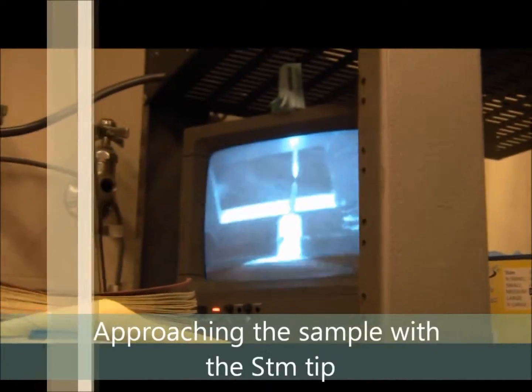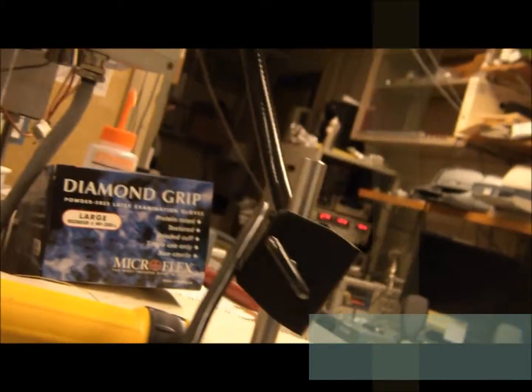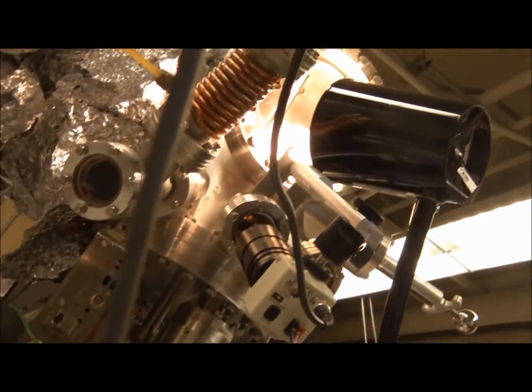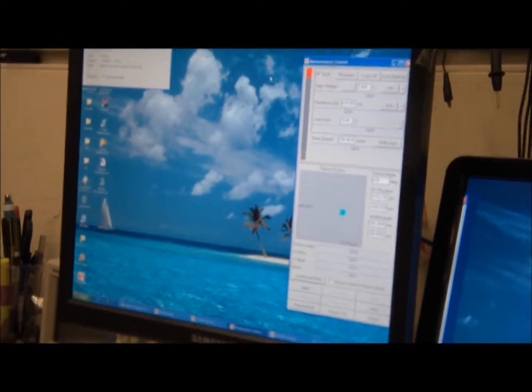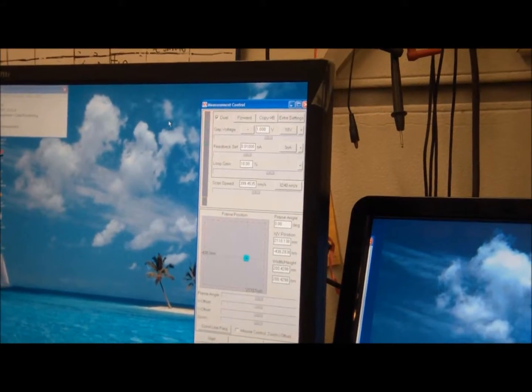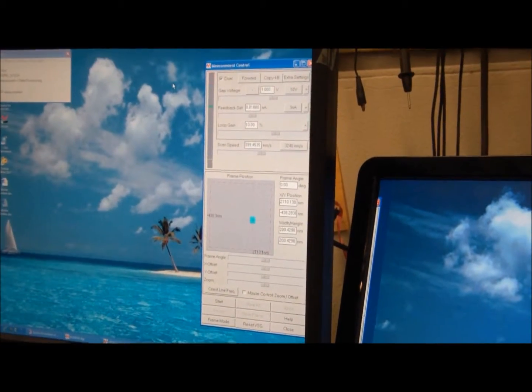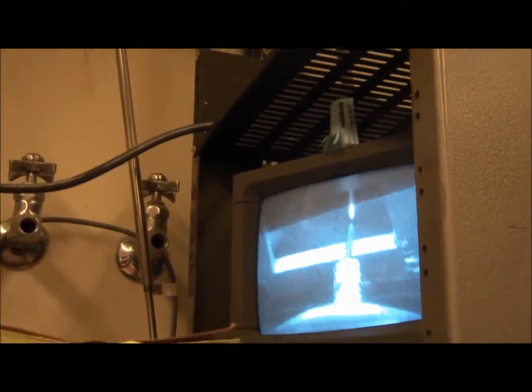The Siamito right here is approaching the gold sample, as you can see by the screen. That screen is connected to the camera, which is right there, and it's looking into the STM chamber. I just controlled this — I had an automatic control that automatically approaches, makes small steps towards the sample, so it can get as close as possible without running into the sample.